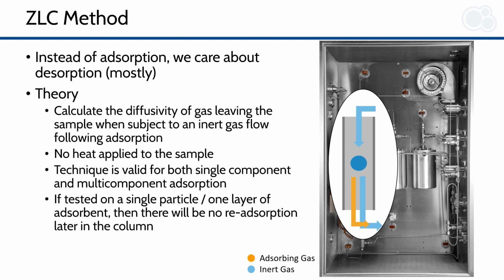Additionally, if it's tested on a single particle or very small amount of material, there will be no readsorption later in the column, so you don't have to account for the fact that a gas could leave one particle and enter another particle to readsorb before it finally desorbs again later on in the ZLC experiment.